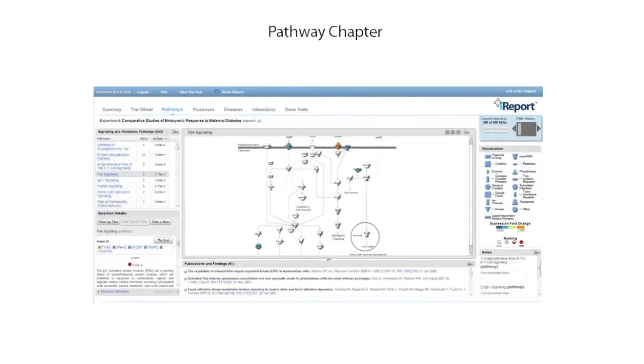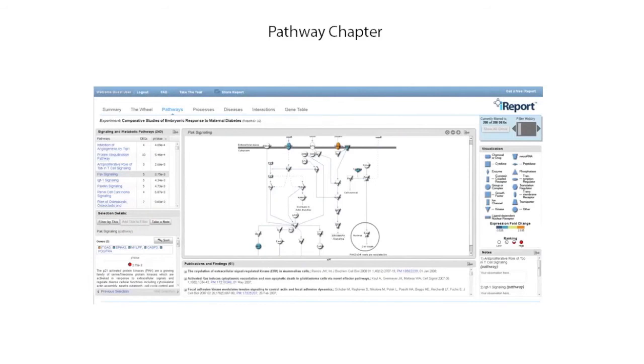The pathway chapter provides you with information on the most significant signaling and metabolic pathways that your set of genes participate in and allows you to explore those pathways. You can also get additional details on the pathway, such as associated genes, pathway summaries, and evidence from the literature that connects those genes to the pathway. This provides additional context to help you determine how relevant this pathway is to your experiment.